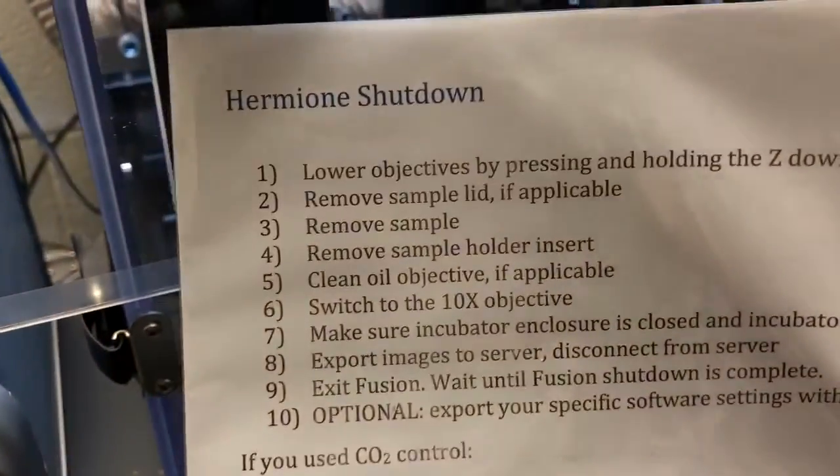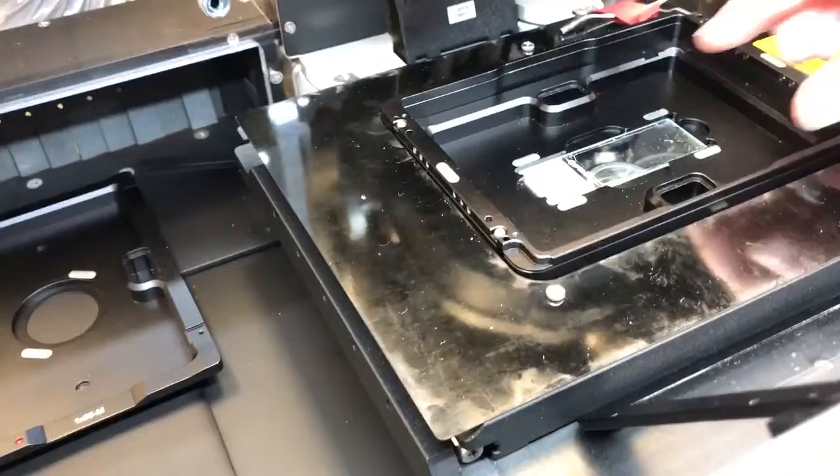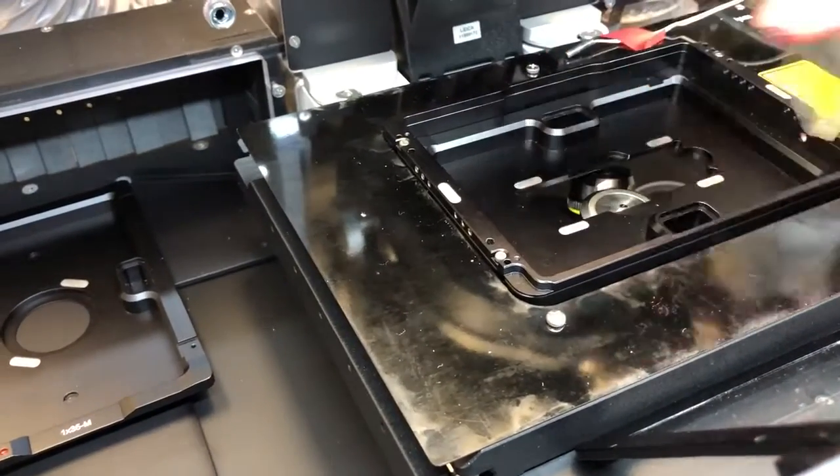Once we've removed the lid we are going to remove the sample — that's step three. In this case it's very simple; it's a slide, so I'm just going to remove it.